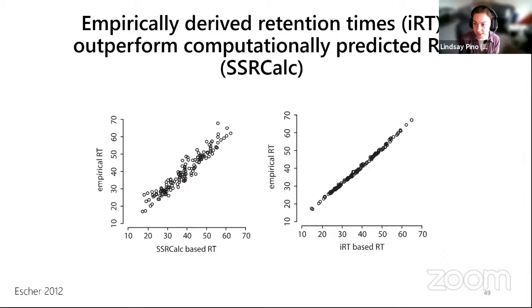Question from Hugo: if I calculate the slope and the intercept on my system with IRT, can I use these values instead of IRT? You could, but I think you still need to use those index values. That's kind of how IRT works: it's taking that slope and the fit of these anchor peptides, refitting those anchor peptides, and then plugging in where an experimental peptide should fall on that line. So I think you're describing exactly how it works. If you have more questions, let's follow up again later. But yes, you're describing exactly how IRT works. So, good intuition.